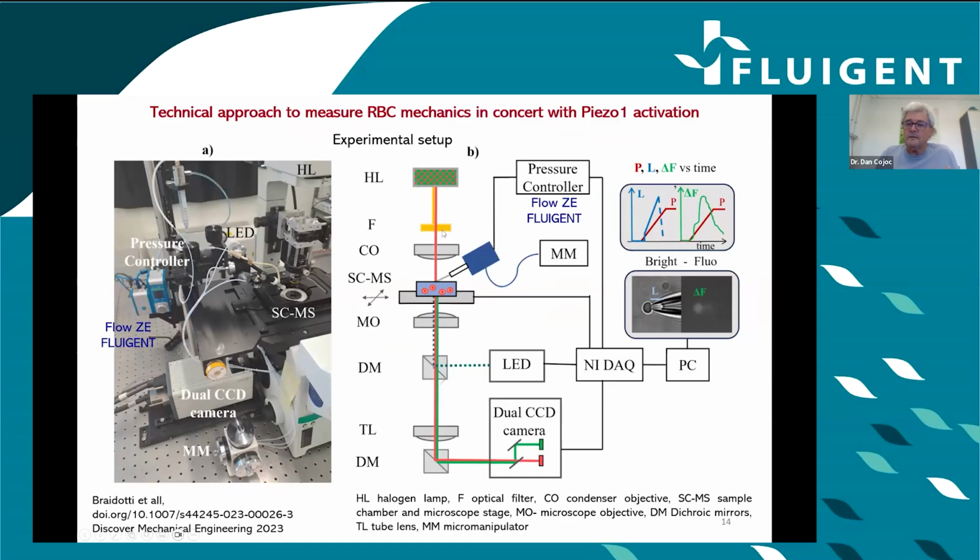It is very important because we block the wavelengths responsible for fluorescence excitation. On the other hand, here we excite for fluorescence. We collect both signals and split them onto two different sensors, but the recording occurs simultaneously, concurrently.